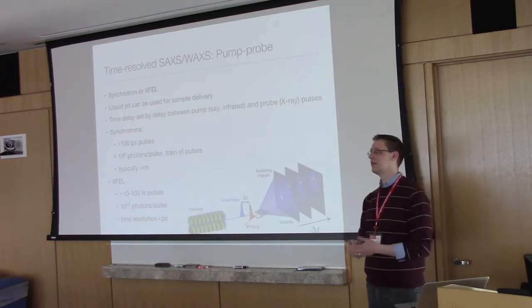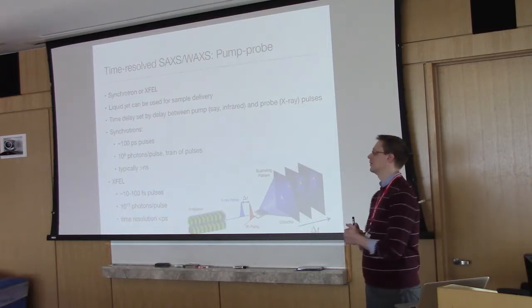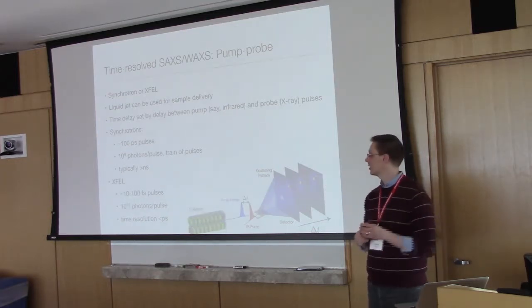Say if you have an infrared or visible light, say you've got a photosystem, something like that, that's light sensitive. You pump it with your light that makes it green or does whatever it does.